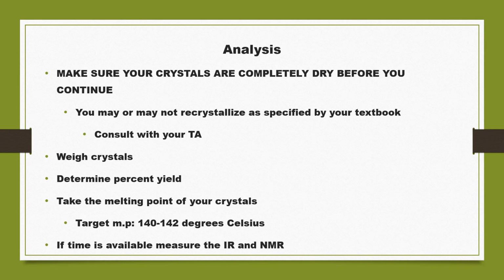So with the dry samples you can weigh, so that you can determine the percentage yield. You can calculate your theoretical yield from the reaction I gave you in the third slide, whereas you can take the actual yield from measuring your experimental yield. By that you can calculate the percentage yield.